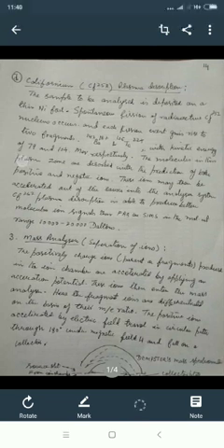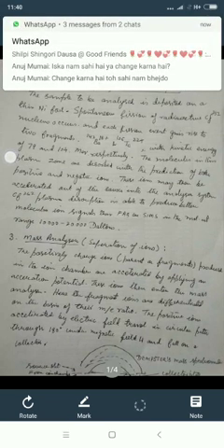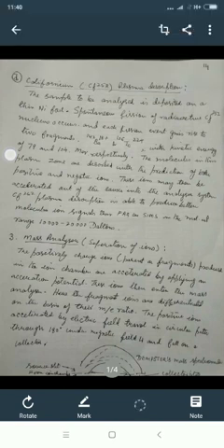The second part, after the ion source, is mass analyzer separation of ions. The positively charged ions, molecular ions or the fragments produced in the ion chamber, are accelerated by applying an accelerating potential. These ions then enter the mass analyzer. Here the fragment ions are differentiated on the basis of their m/e ratio.